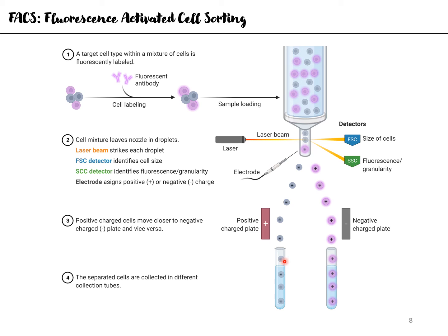I'm sorry, no, it can impart only two types of charges, positive or negative. So it will impart positive charge when either of the markers is present. Fine, that is how it is fed.